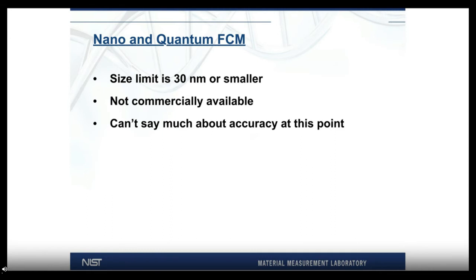We're also looking at nano and quantum flow cytometers. We have one that was built at NIST, and it promises size limits of 30 nanometers or smaller, but these are not commercially available, and we don't have enough data to say much at this point about accuracy.